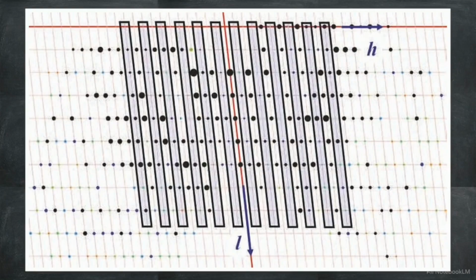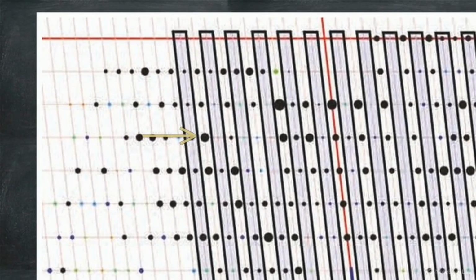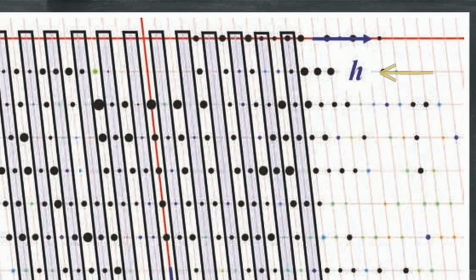This chart maps a cross-section of reciprocal space, showing the first fingerprint of pure translation. When translation vectors approach integer fractions of the unit cell, they cause destructive X-ray interference. The fractional shift generates systematically weak alternating layers directly along the H-axis.